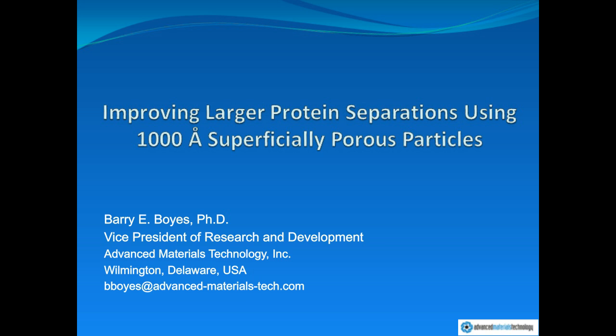Unless you're talking about covalently aggregated or covalently stabilized aggregates, it would not be the technical approach to resolve based on aggregation state. You can resolve aggregated from non-aggregated proteins by reverse phase, but typically not under high resolution reverse phase conditions.